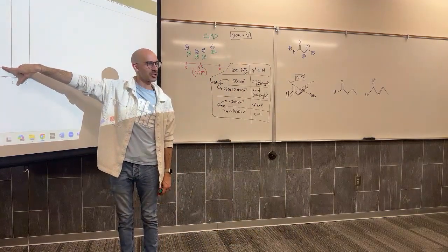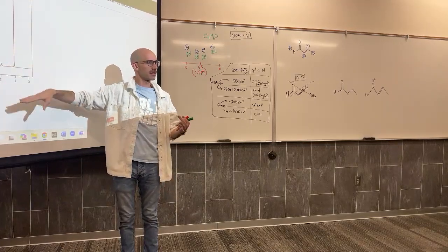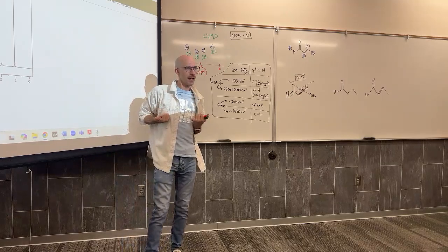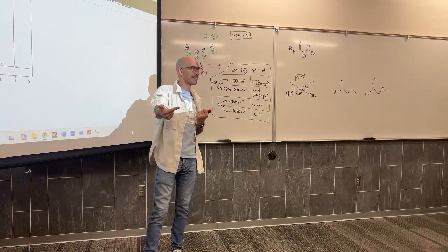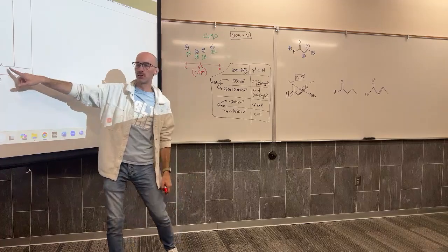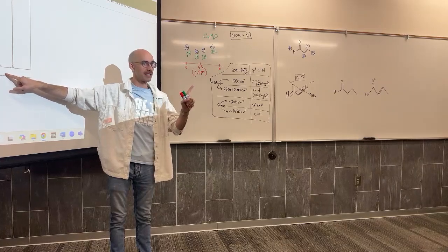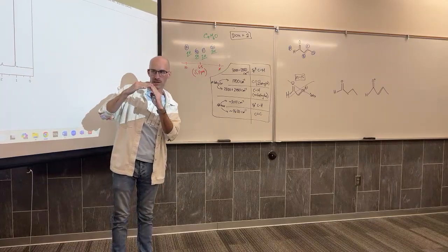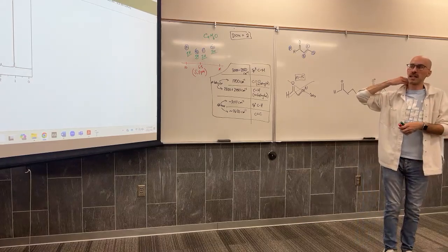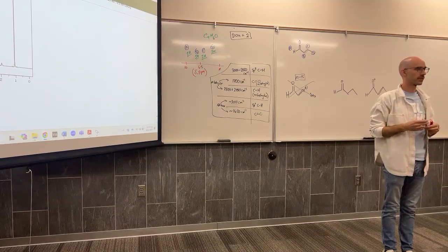Right here, the NH hydrogen, right at 2. Why? Mostly because of hydrogen bonding. The molecules in this sample being analyzed are hydrogen bonding with each other. So yes, the nitrogen is de-shielding the hydrogen, but another molecule's nitrogen is sharing electrons with that hydrogen through hydrogen bonding, re-shielding it. So signals of OH and NH do not show up as far left as you might expect, but they always show up as singlets. They sometimes show up broad because of that hydrogen bonding. The hydrogen bonding changes the nature of the hydrogen's environment, so it gives off a wider signal, more characteristic. I wanted to talk about that.